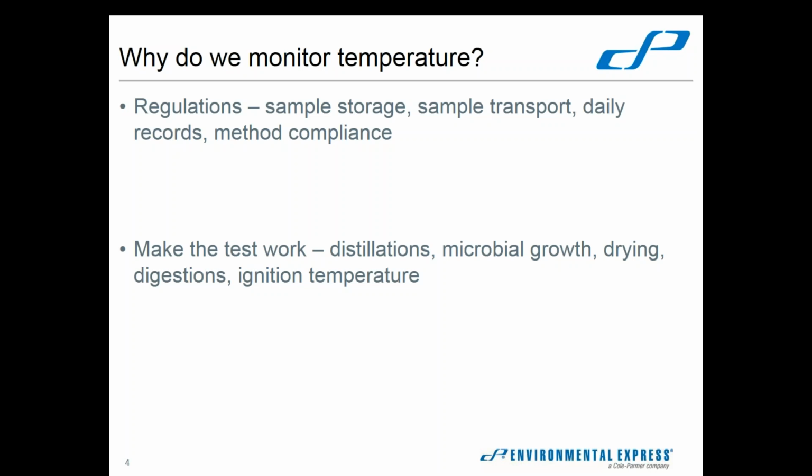And then there's the actual practical part of monitoring temperatures. Sometimes the temperature actually is important for your test to work. Your distillations, your microbial growth, all of your microbiology testing, drying things, doing digestions. Any of you who happen to do volatile portions of your gravimetric solids analysis know all about your ignition temperature.